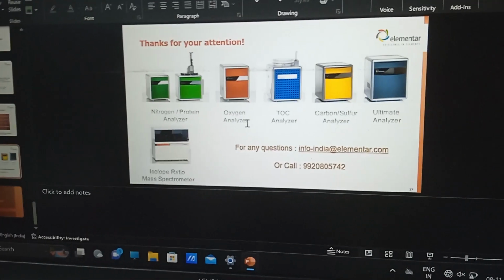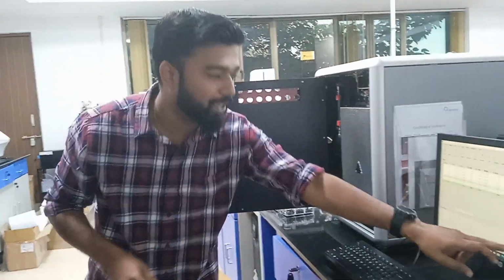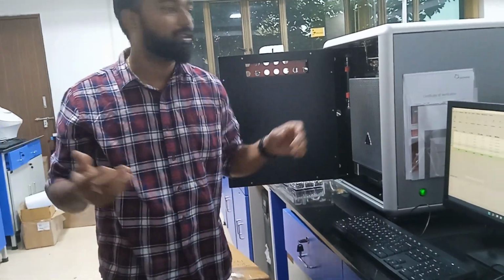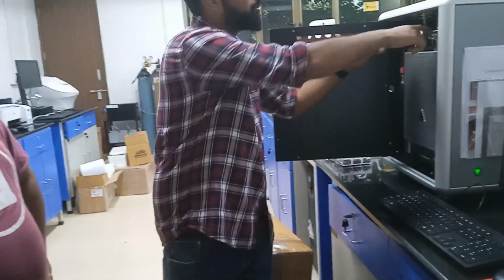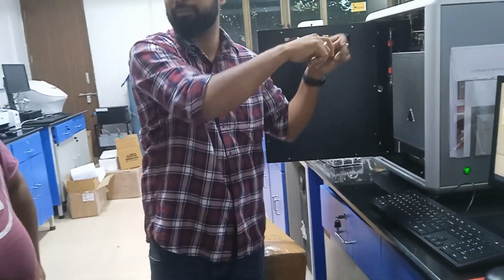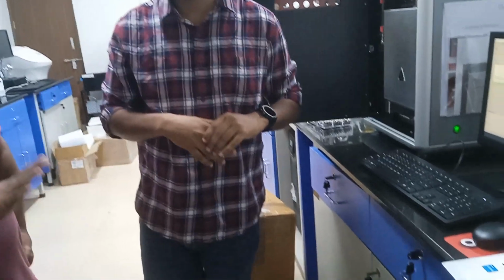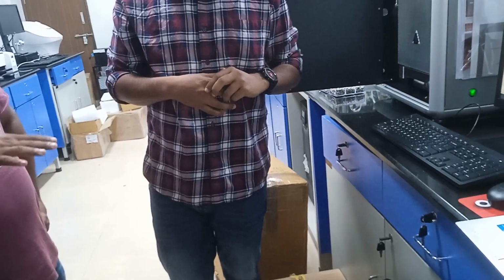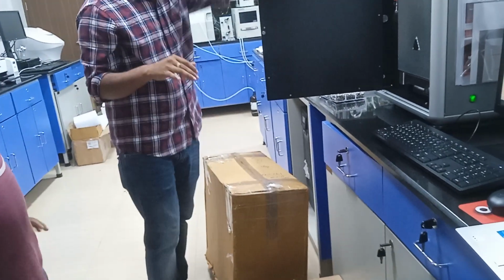Igor is a different company, right? This clamp, if you are not putting it properly, the helium flow will be exceeding. At that time it gives an indication that it is flowing in excess. So put it properly, make the connection one more time. It is fine, it will be arrested. The connection will be opened now after this completion. So again reinstallation, nothing else is there.